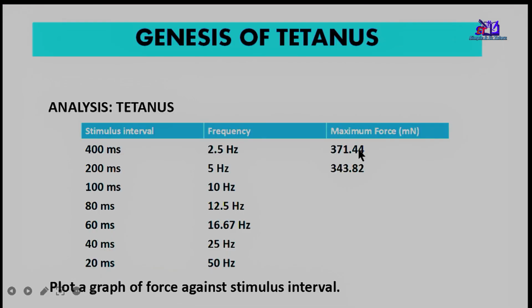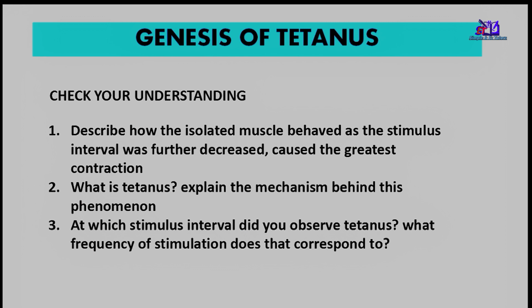All right. After inputting your values into this table, you're going to plot a graph of force against stimulus interval, and then you're going to check your understanding, and this serves as a guide in your discussion. Just use it as a guide to your discussion.